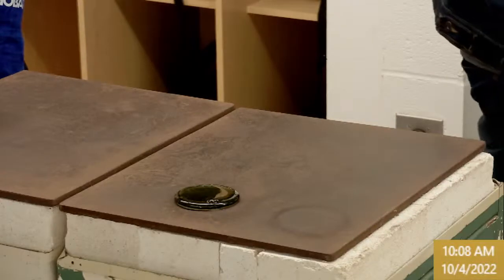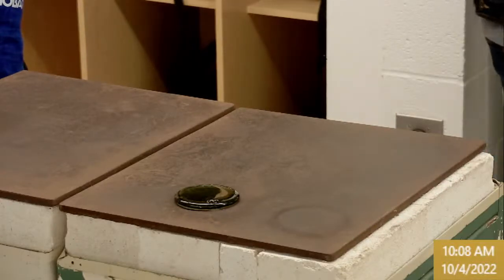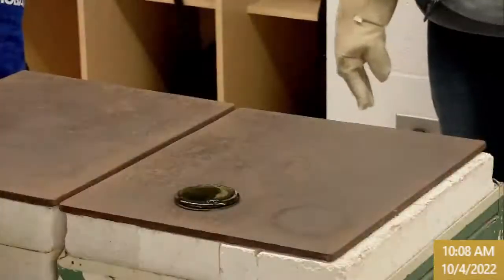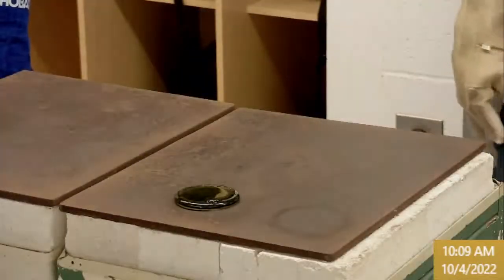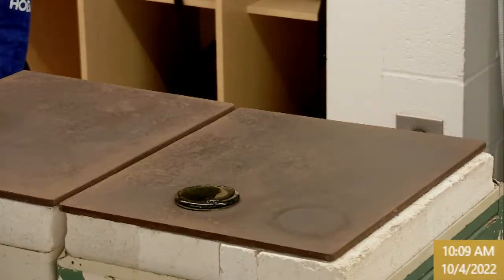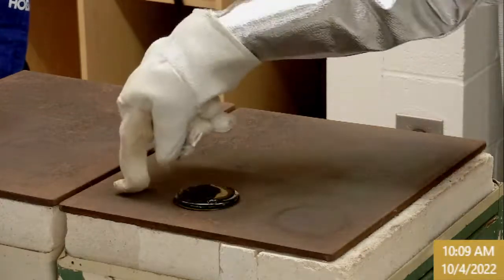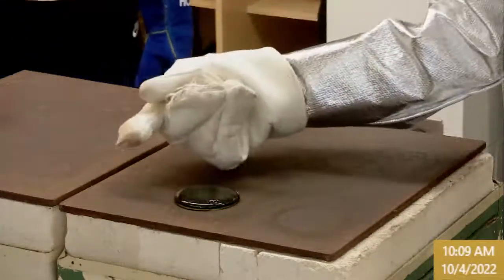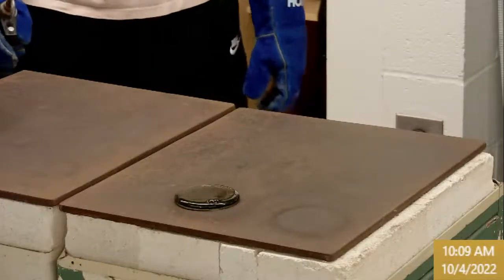So, okay. D2. C2. Oh, that's right, I was about to pour C2 when all the excitement happened. So this is the Mason sand with chrome. So, all right, we'll pour it in the same spot. So we'll be targeting right there. And try to angle the flame a little bit away from this one, so maybe at an angle about like that for now. All right, let's do this.